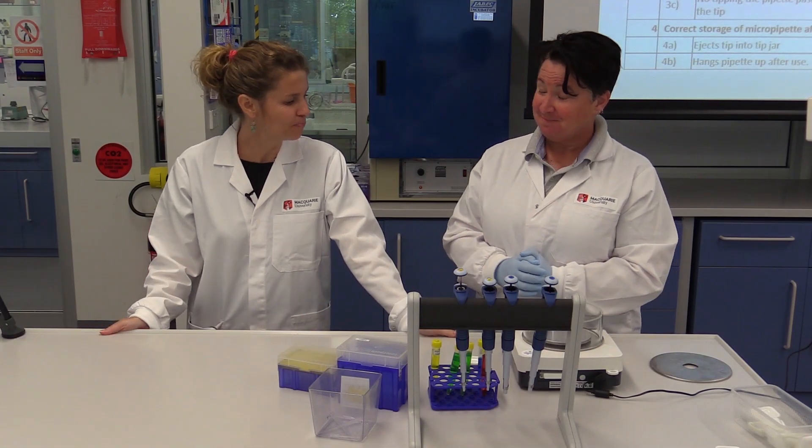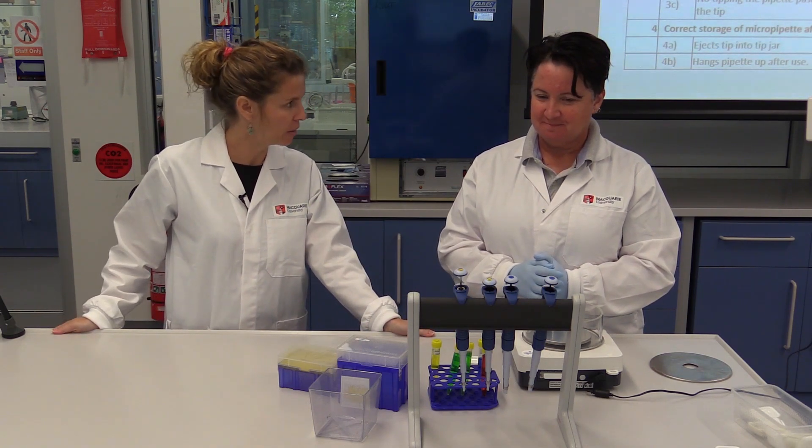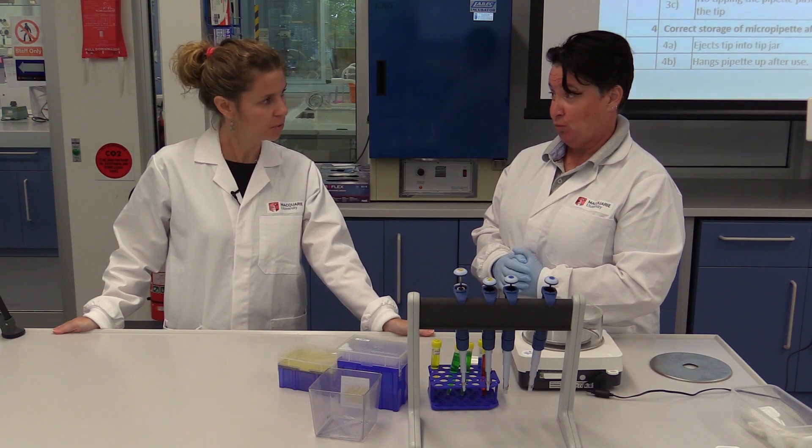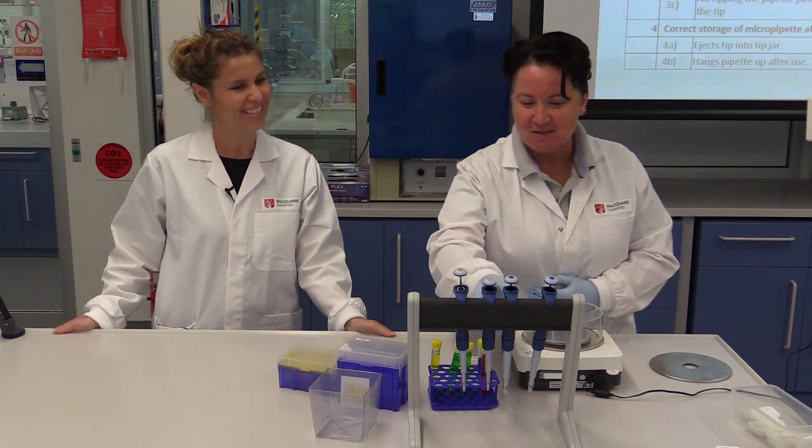Okay, Michel, it's your turn. Could you pipette, please, 22 microlitres? 22? Yes, please, from the green solution. From the green solution. 22 from the green solution.